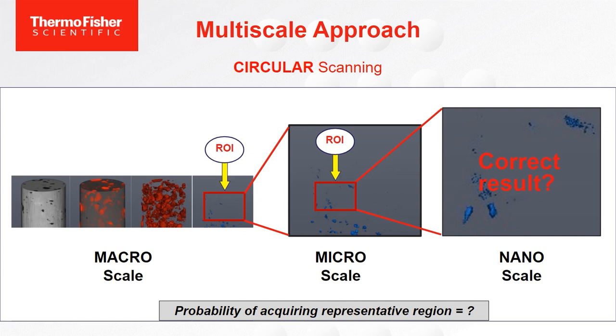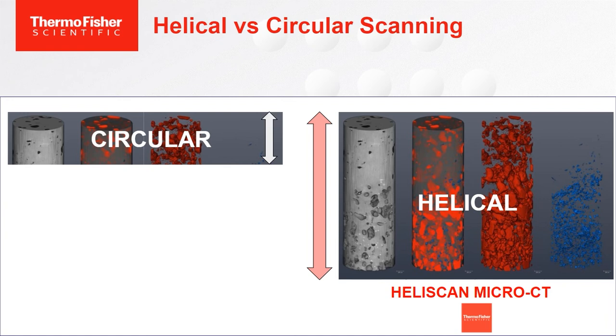And of course, that's different depending on different samples. But as you can see in this particular example, there would be a strong penalty for not being able to understand or initially see where the region of interest might really be, so that you can understand the true structures in your sample. And sometimes you even might have to take multiple high resolution scans to be able to adequately represent and understand your sample.